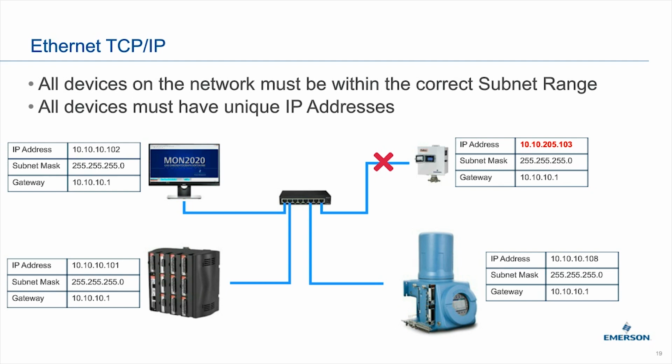We've actually decided not to allow that, and the fundamental reason is that if there's one person connected and they make a change, and someone else is connected to that GC at the same time, they may make that change back.